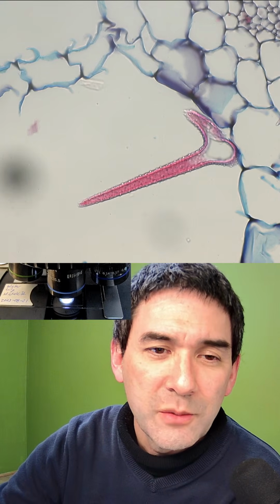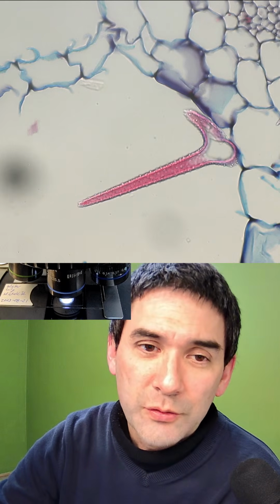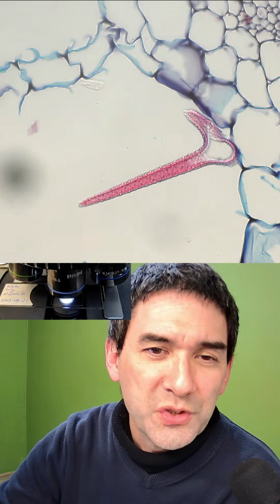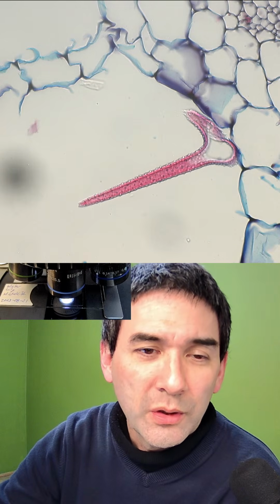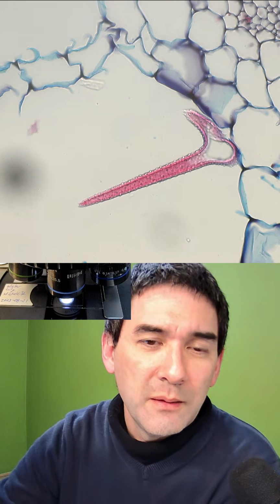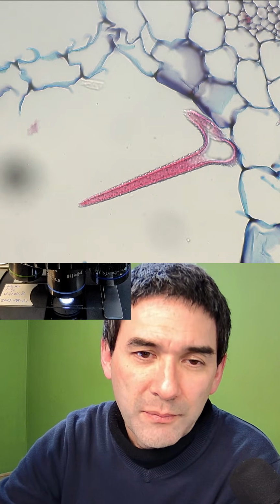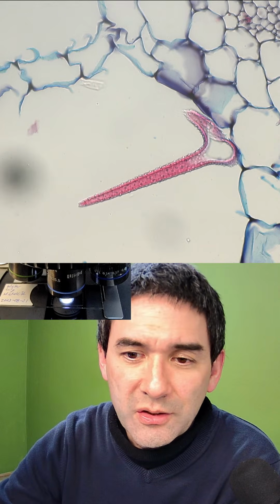Yeah, and these are basically these crystals that are forming on the inside. And I did a little research because I wanted to know what they are doing. There seem to be two possibilities. Either it's some kind of protection against being eaten, and/or basically it's calcium storage. So if there's too much calcium, then it will simply store it in those crystals here.